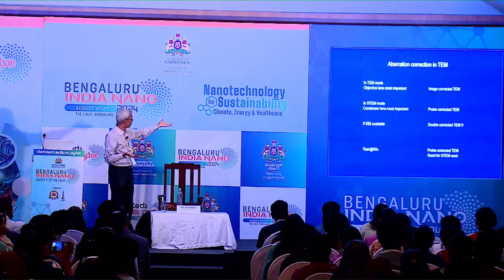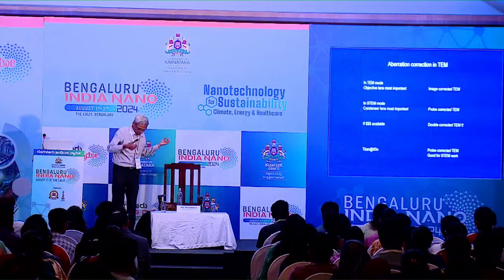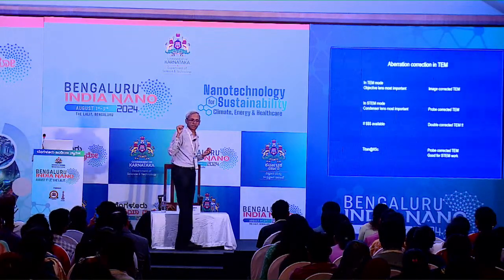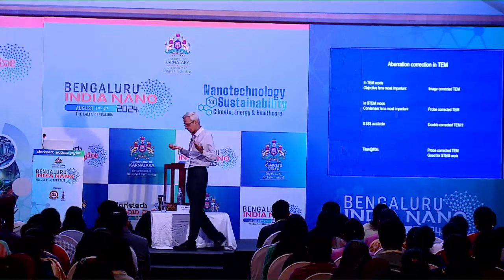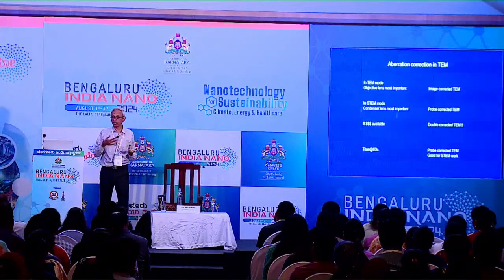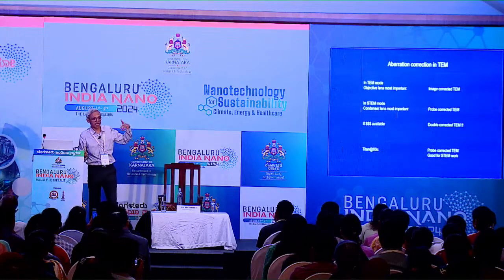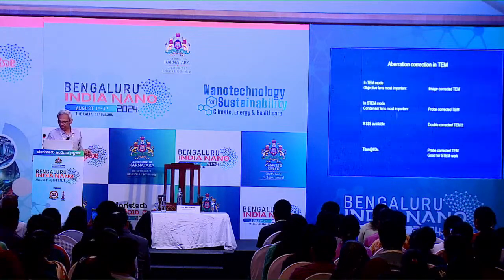We have one such probe corrected microscope at IISc. That, by the way, is actually a national facility. I will talk to you a little bit about the facility at the very end. If you are interested in accessing and using it, of course, it's on a chargeable basis. All of us have to pay for that. The charges are fairly nominal for students and educational institutes in particular. You can look at the AFMM website at IISc and get in touch with one of us to see what can be done.